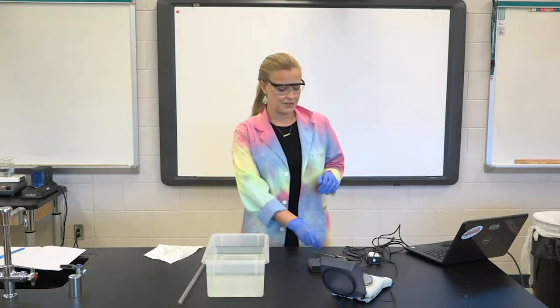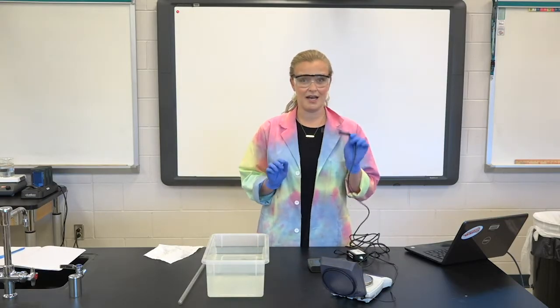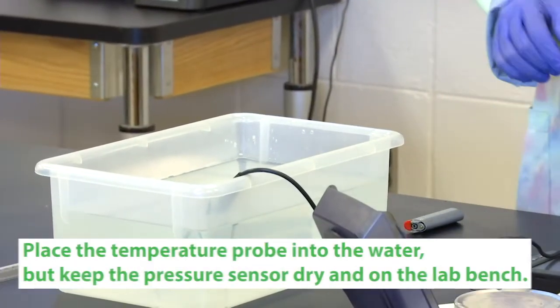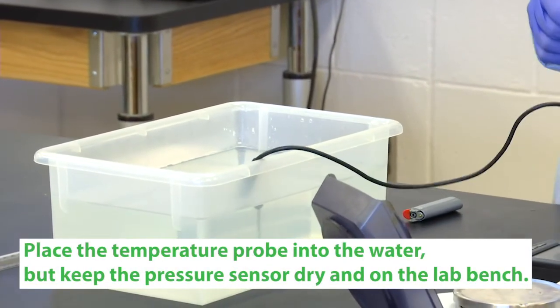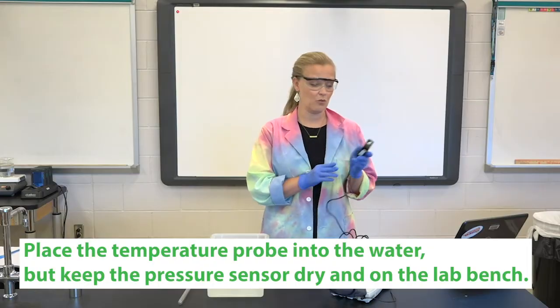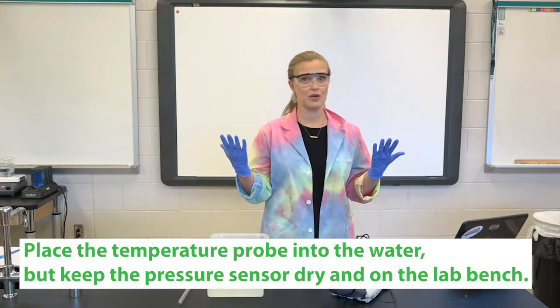Now the only other thing we've got to do is get the probes set up. We put the temperature probe in the water, so it'll give us an accurate reading of the temperature throughout. The pressure sensor is a gas pressure sensor, so we don't want to put it in the water — we just leave it out here and it'll tell us the pressure in the room.